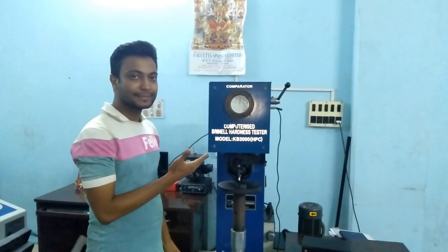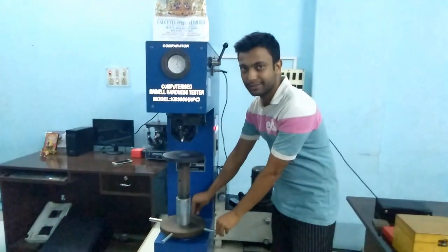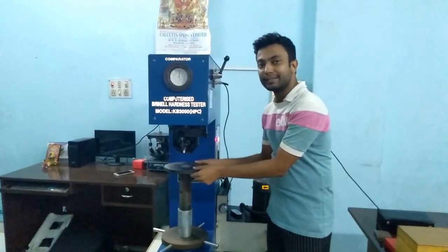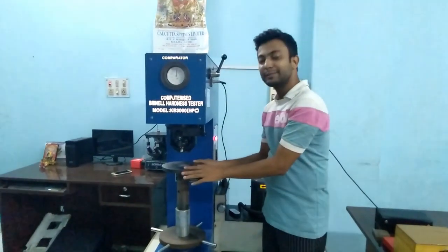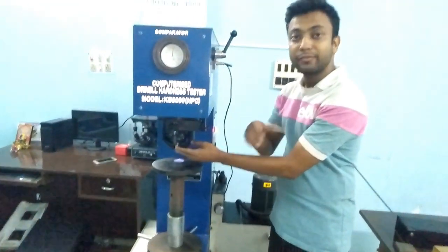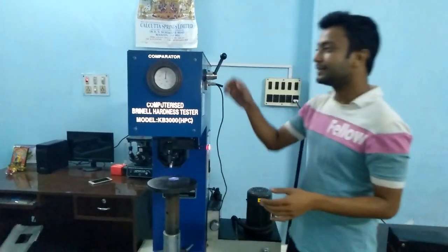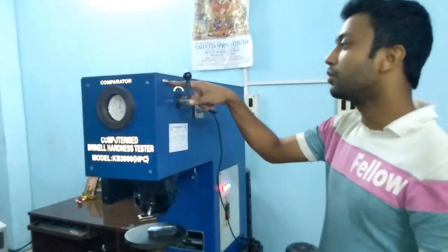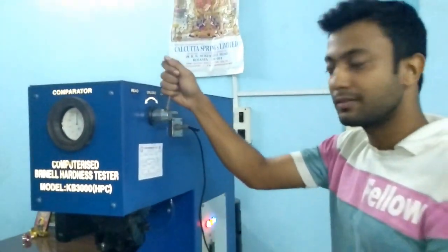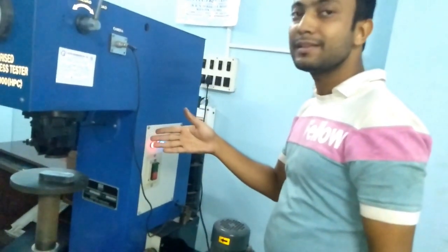This is a computerized Brinell hardness tester. Before starting the test, I will show you the components. The first component is the hand wheel. By moving it clockwise and anticlockwise, we can move the anvil up and down. This is the elevating screw. The anvil is basically the place where you keep the sample and do the testing. This is the indenter — I will tell you about the indentation process and indenters later. This is the lever. You can see three positions: load, unload, and read. We can move it down to load and unload. There is a load behind the machine which loads the sample and makes the indentation.